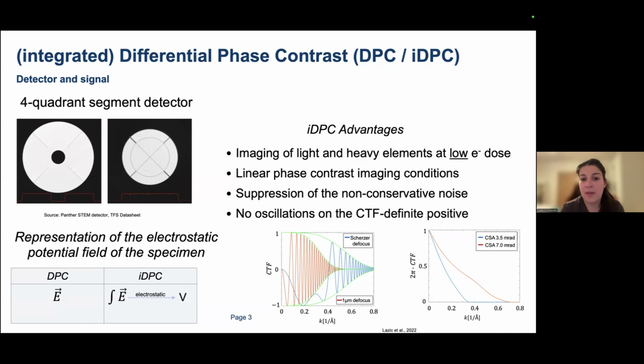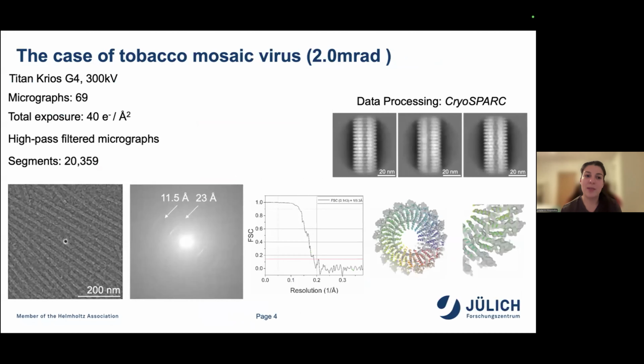Also, there are no oscillations of the CTF, and then we have most of the signal. And at the end, as the field is electrostatic, the non-conservative noise which is produced is suppressed. And with that being said, I will jump directly to some of the results.